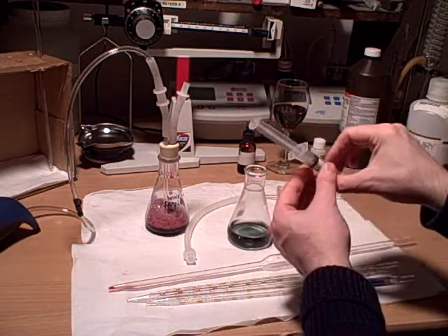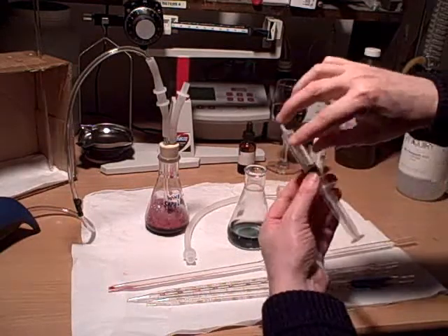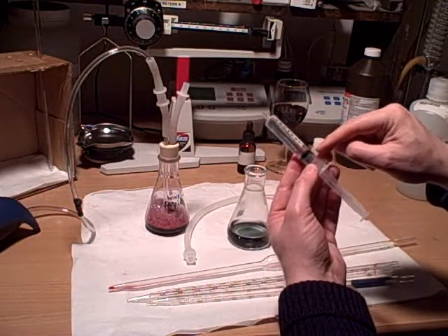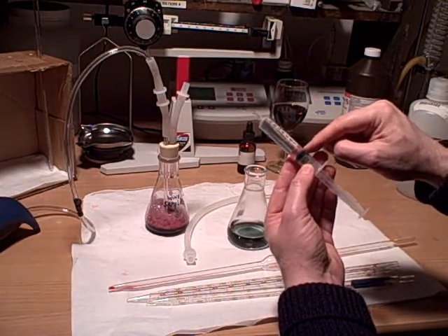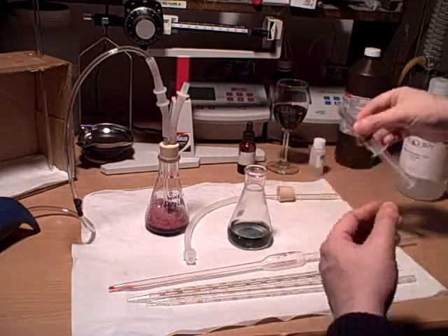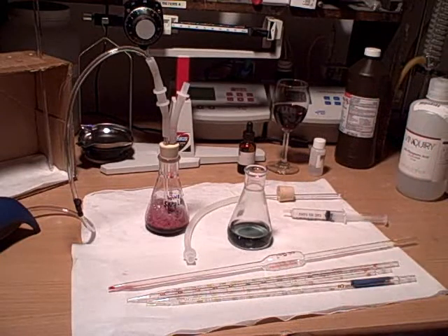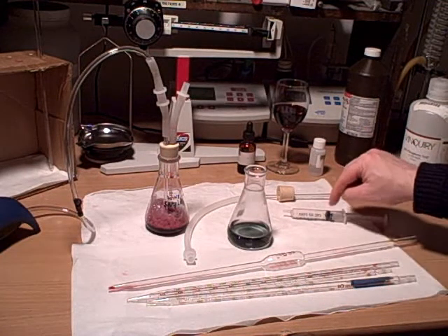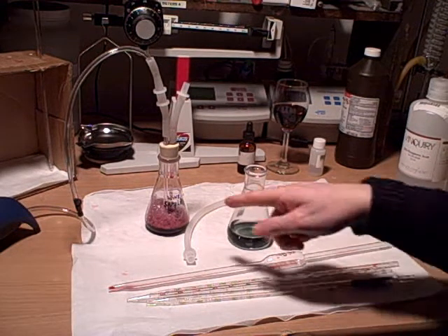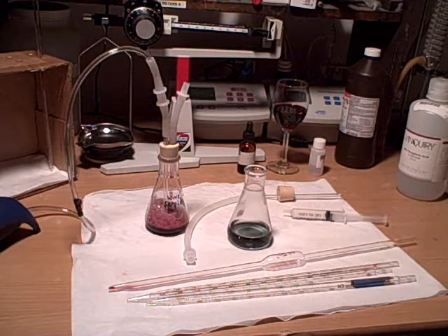So now what we do is look at our syringe. From the 10 mil mark, I finished — it took me basically 1 mil, so from the 10 to the 9, that's going to be 1 mil. The multiplier is how many mils you wind up using times 16, and that's how many ppm of free SO2 were in that wine sample. Since it was 1 mil, that's 16 ppm free SO2 in that wine sample. And that's the test.